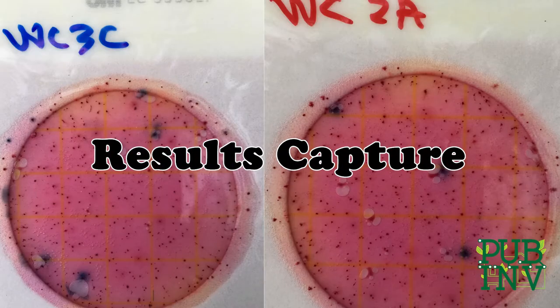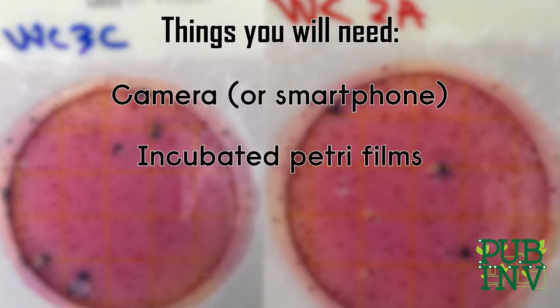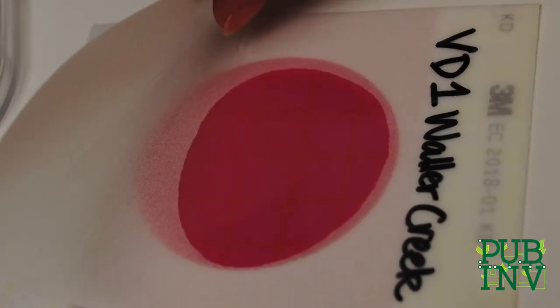Step 3 is bacterial growth and capturing the results. For this, you will need your camera, your incubated petri films, and the pre-addressed gray envelope. After completing step 2, you should take a picture of each of your petri films. These initial pictures will be used as a baseline for visualizing bacterial growth after 48 hours. You will want to move your petri films to a safe place, leaving them lying flat in a room temperature spot. They can safely be stacked together though.